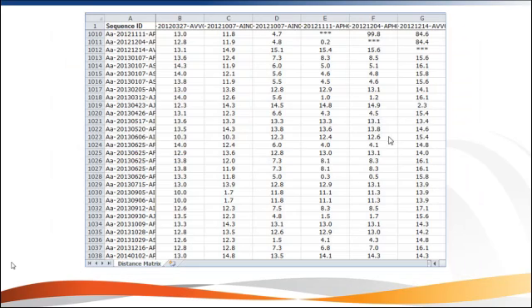So we have huge matrices of homology and heterology, and also huge dendrograms. It's pretty difficult when we would like to make subgroups from those huge databases, filtering or sorting that information into smaller subsets. It becomes very complicated to do all that sorting and getting back to those programs that we used to use.